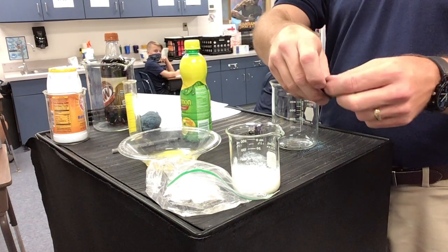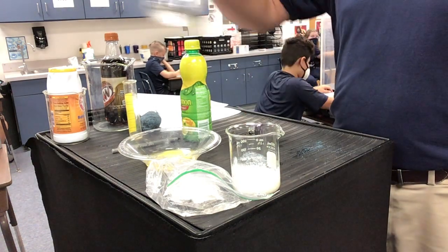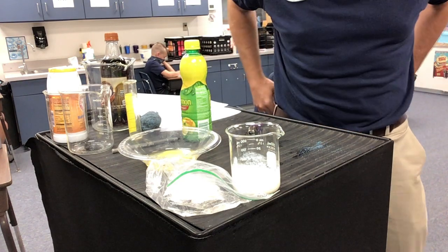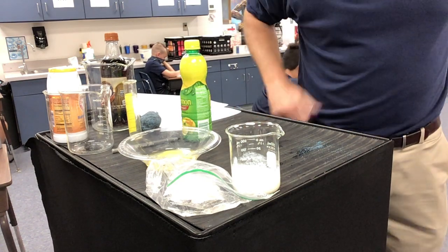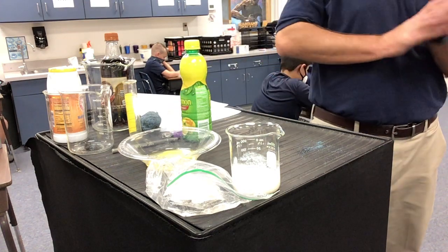I'll give you a hint. Yeah, I can't hold it. And finally, is there a new physical property? Is it something completely new? And then you should be able to tell me if it's a physical or chemical change.